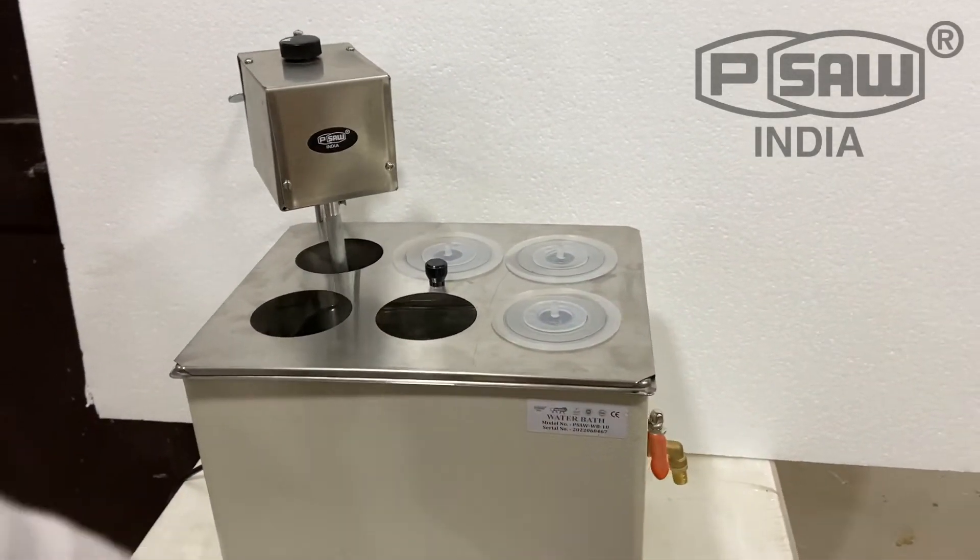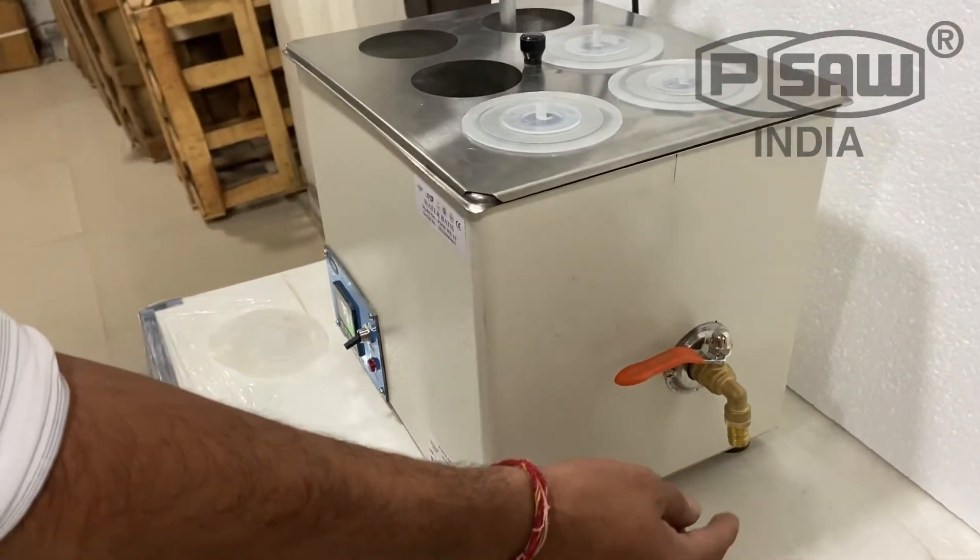It also has a drain plug for taking out the water.